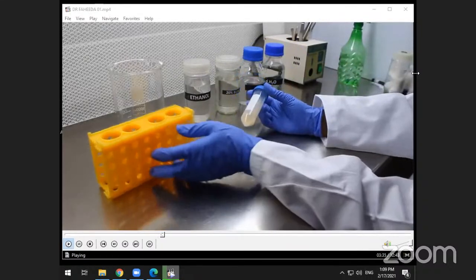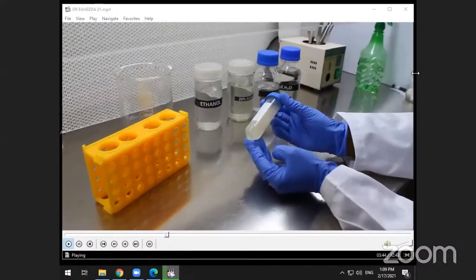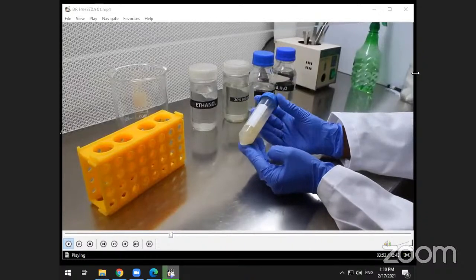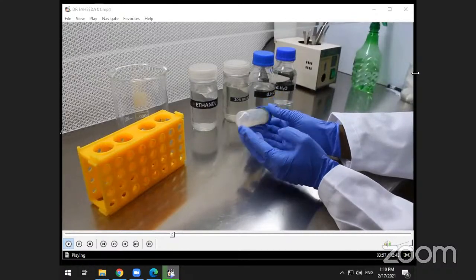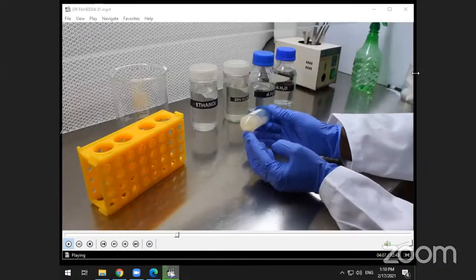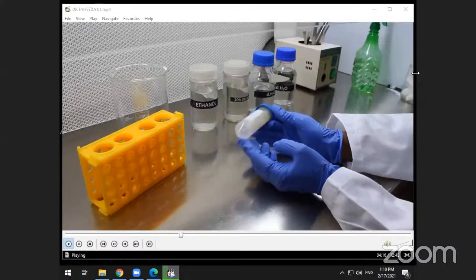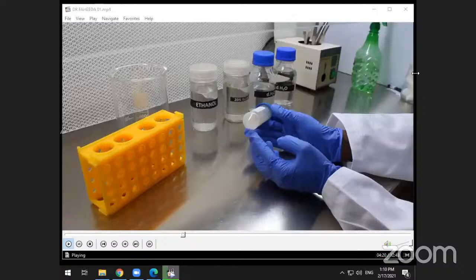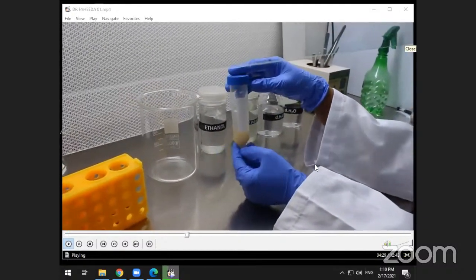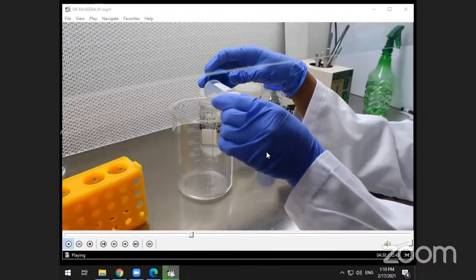Shake a little so that seeds get fully exposed to the ethanol. After 30 seconds, discard ethanol carefully in a discarder.